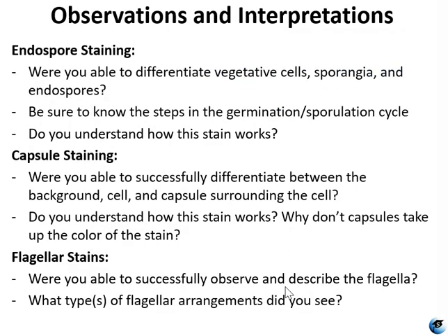We didn't really have any safety guidelines for this lab since you're not doing hands-on experiments, but you should understand and know that for the endospore and capsule stains, the safety stuff would be the same as it would be for any other stain with your acidic or basic dyes. And then for the flagellate stain, in addition to those safety regulations, you would have to use laminar flow because of the tannic acid and heavy metals.